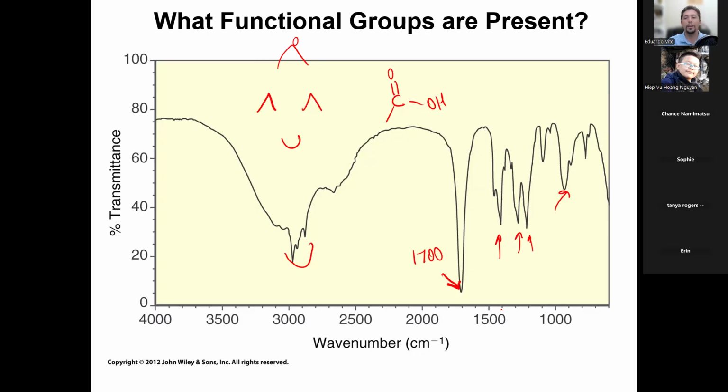So it's not maybe an OH stretch, it's definitely an OH stretch. So remember that when the OH is part of a carboxylic acid, it usually starts at 2500. You can kind of begin at 2500 to 3500. So this is like the really broad OH signal right there. If you see a range of 1000 wave numbers, that's most likely the wizard's beard OH right there. Make sense? Okay. So next example.